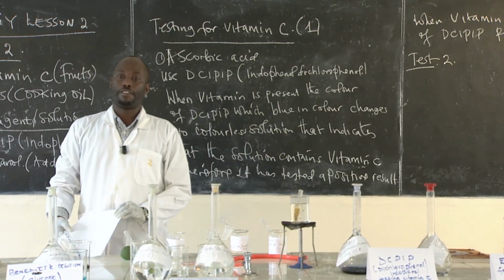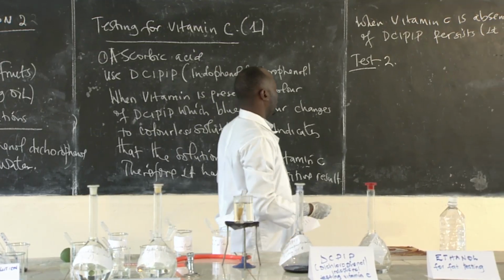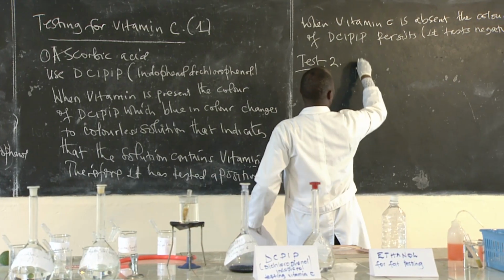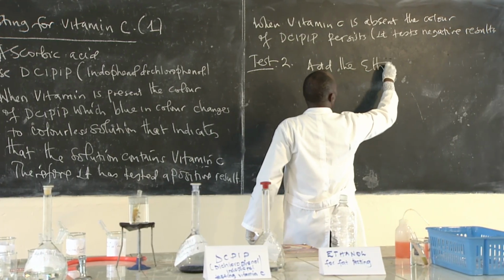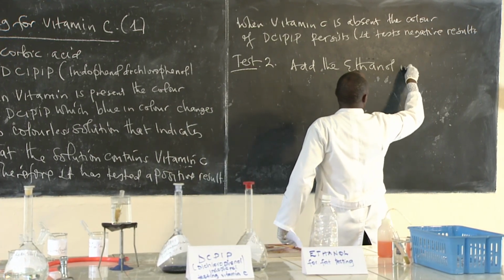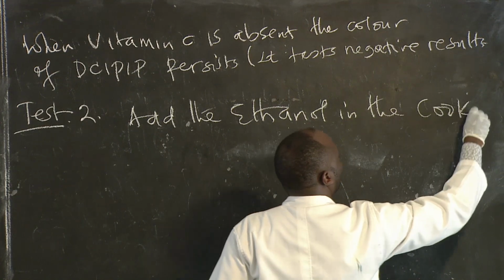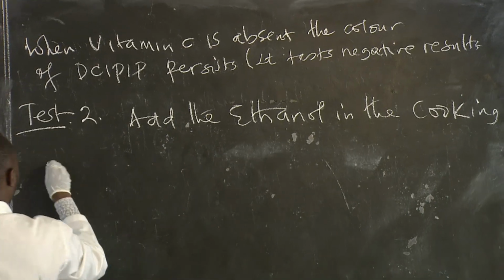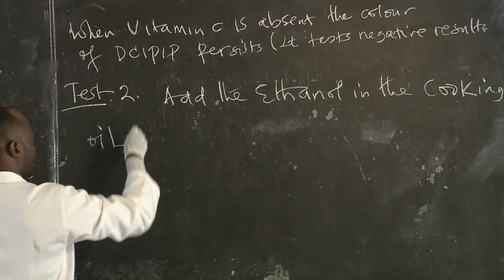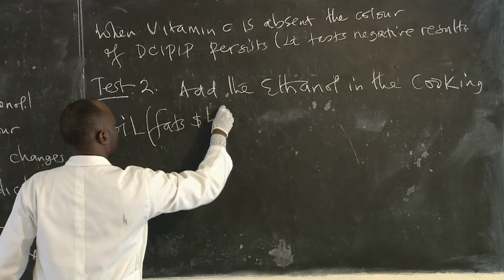As you can see, when you add the ethanol in the cooking oil, I can say in bracket, they can talk about fats and lipids.